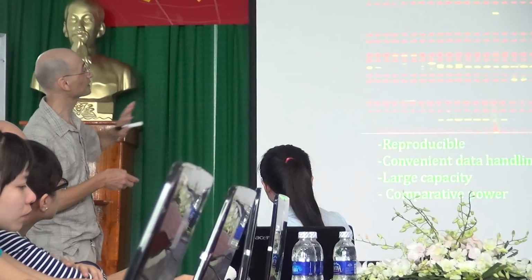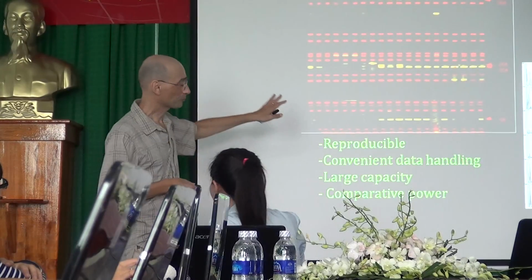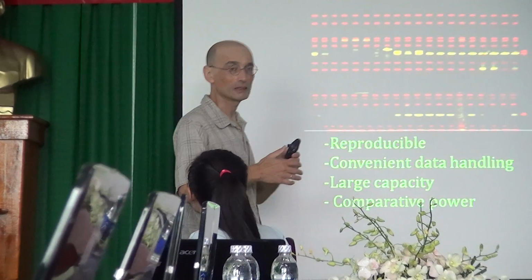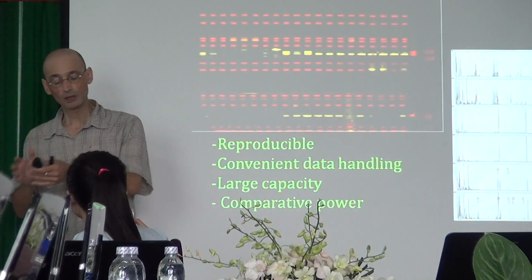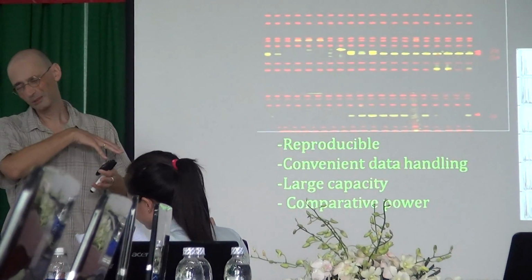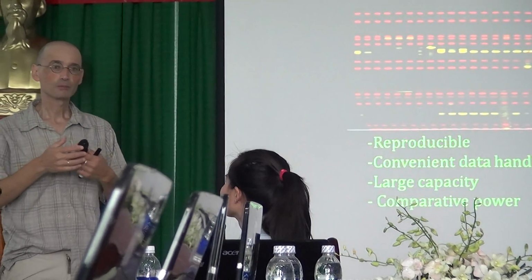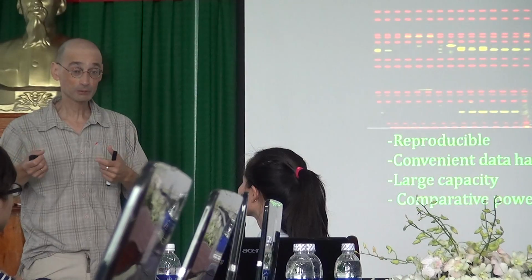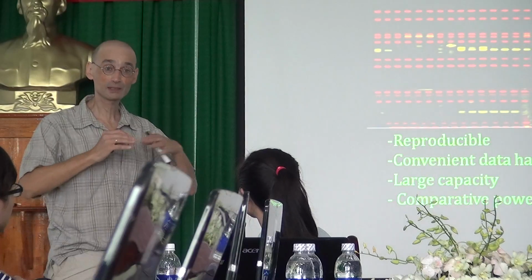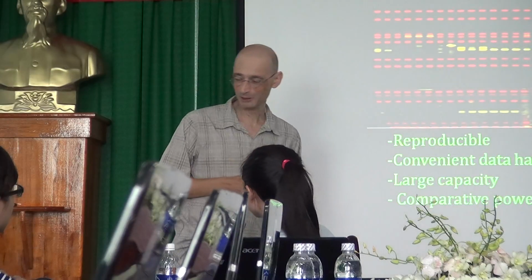And this is something very specific for us. This type of machine is the same machine used by forensic police departments to do DNA tagging of humans. So we have a project, and I'm just going to mention it in the next slide, in which we analyze soils, but we work in conjunction with the police department in Jerusalem, and we use their machines in order to run the TRFLP because it's exactly the same machine. It's just for this project, but it's an interesting story.